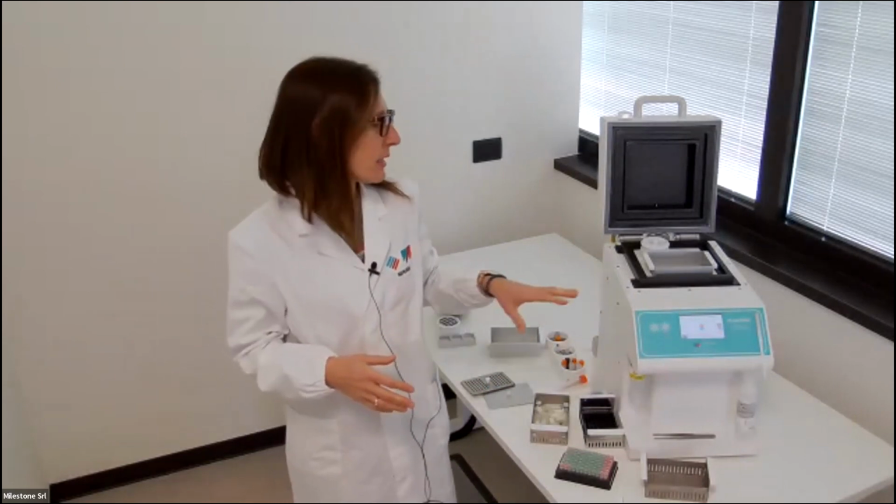When you set up the freezing profile, you can start the freezing when you want, so also at the end of the working day. So the system will follow the set profile, and the next morning you will find a sample correctly frozen and at the ending temperature that normally is -80 degrees.